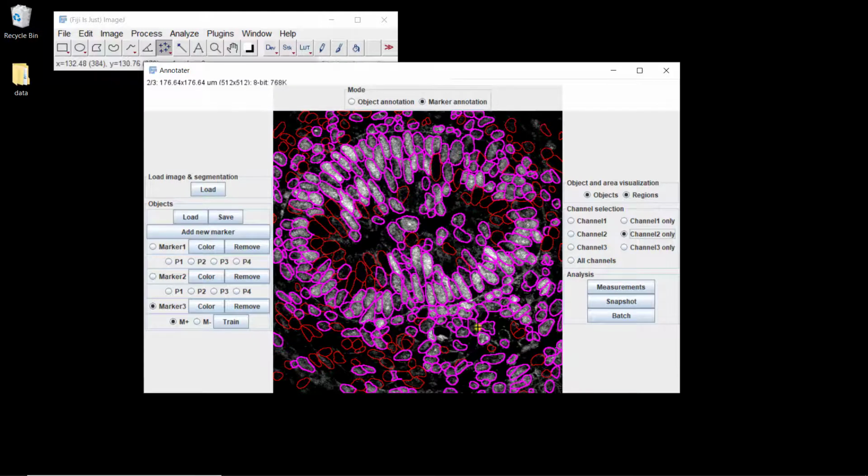So that's the previous training. So here you can add new nuclei in your training dataset. Like here, it's too sensitive, I think. So I'm going to remove this one, for example, and this one, and I can train it again. And you can go on, and when you're happy, you can then batch process a whole set of images. You see, the thresholding was also conserved, so those are the results with the same thresholding and same parameters that were used for the previous image. So you can also look at your thresholding, see if it makes sense.